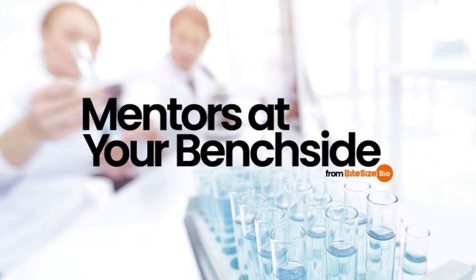Number 7. Problems with lysis and neutralization. We have covered alkaline lysis in great detail, and typically, these reagents in the midi-prep kits are stable and fine. Solution 2, the one containing sodium hydroxide and SDS, can break down over time with exposure to air. So if it is old, that could be an issue. In general, they work for lysing bacteria for the life of the kit. The biggest mistake people make in plasmid preps is with the lysis and neutralization steps.